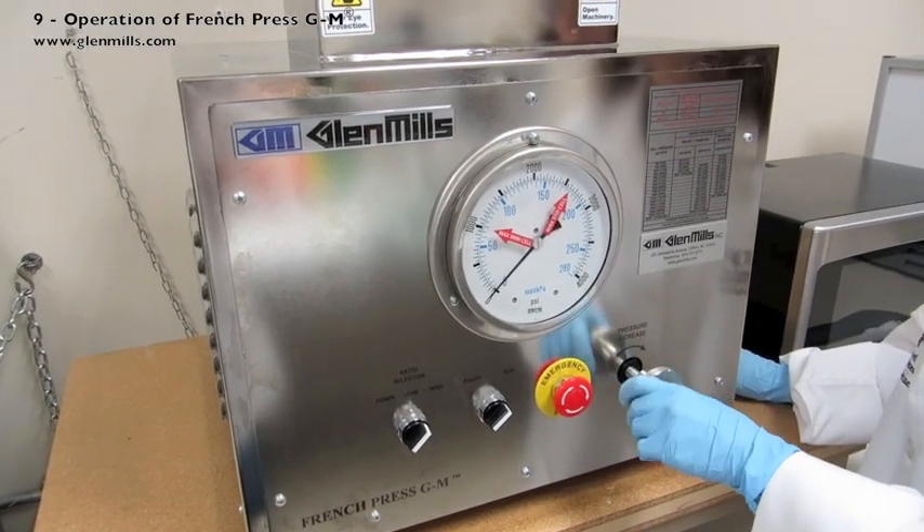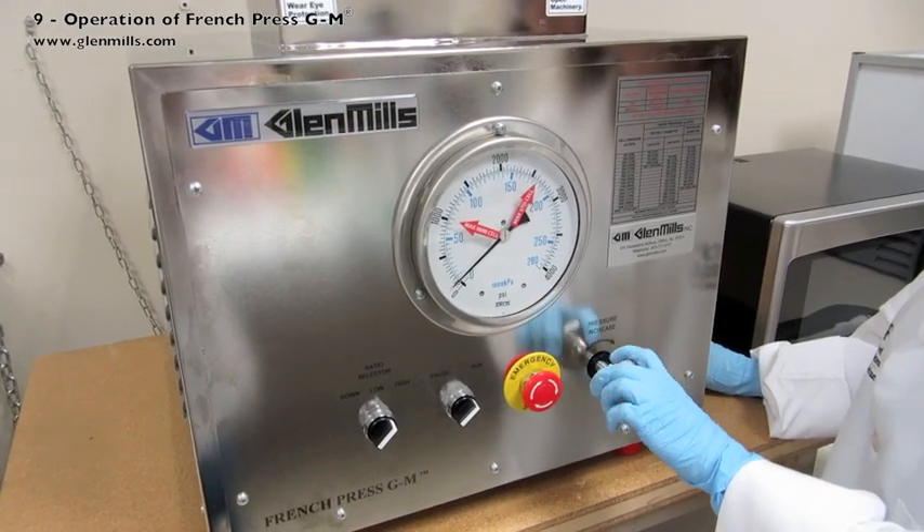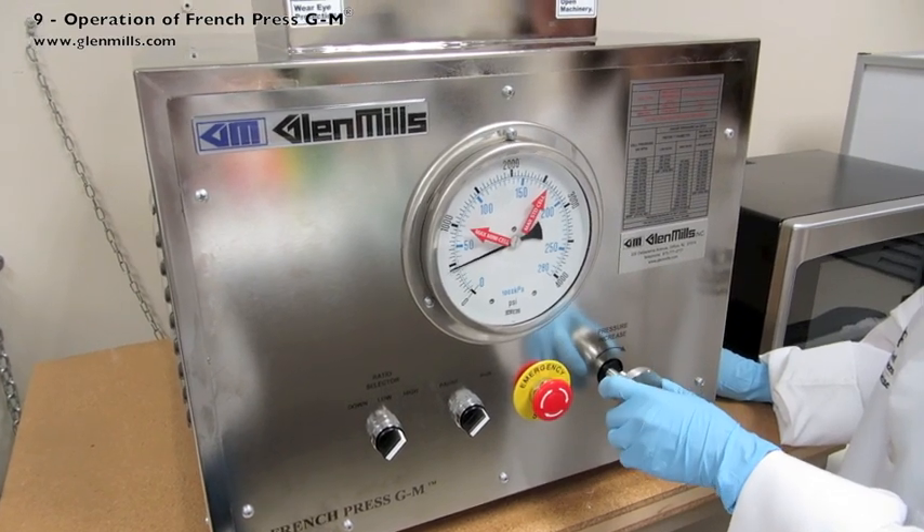Adjust the pressure increase knob clockwise until the pressure gauge reaches the desired value. For this example run, the target is 1280 PSIG.